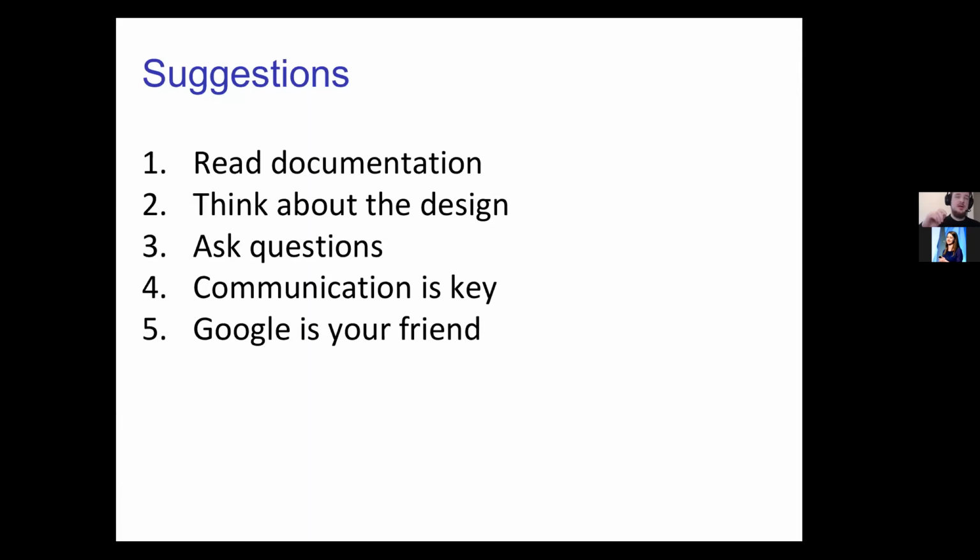So ask questions. I have provided some links in the next slide to forums where you can ask questions. Software is often deposited in a public repository like GitHub, and there you can communicate with the developers and ask them questions. They're the best people to answer them.